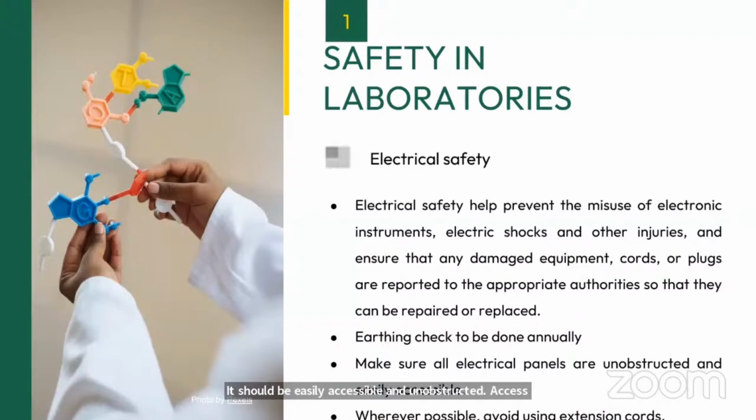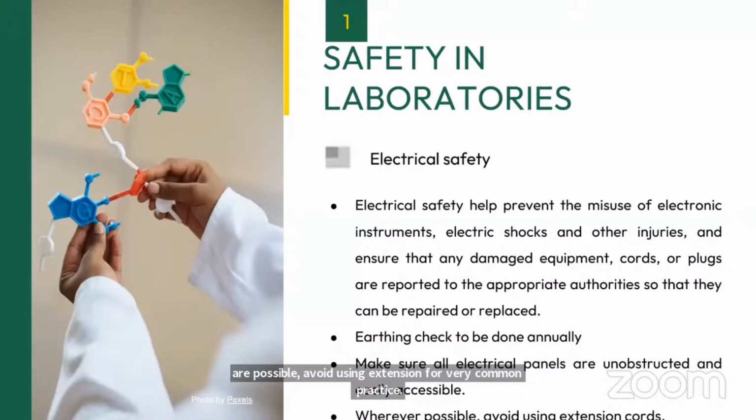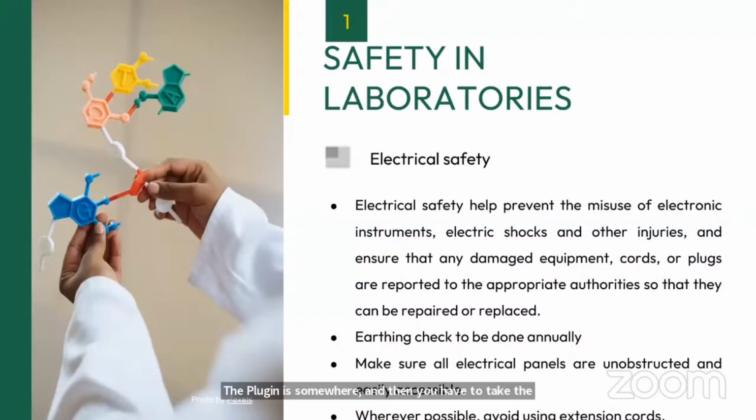Wherever possible, avoid using extension cords. A very common practice we have seen in laboratories: the plug point is somewhere and you have to take the connection from one part to another, then you will use one extension box. Avoid all types of extension boxes and extension cords. Avoid all types of hanging and loose wires in the laboratory.